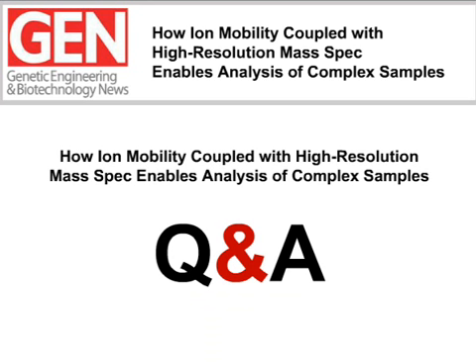Okay, well, thank you very much. And John, can separations in gas phase ion mobility be tuned, like tailoring the conditions of mobile phase in liquid chromatography? It's a good question. That's a very interesting question. In the 70s and 80s, ion mobility used to go by the term plasma chromatography, but the separation mechanism is not a chromatography in the sense that you can write a partition coefficient.